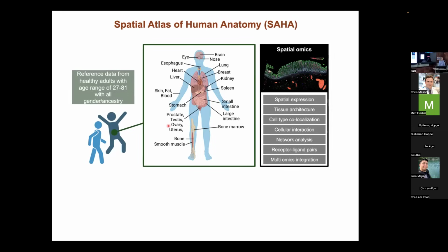So prostate, the whole prostate's been going on there pretty much. But for colon, we just have a few segments from that specific area. The thing is, within a specific zone, the heterogeneity that we've been seeing in a particular anatomic area has been somewhat okay and not creating significant statistical issues. But we've been seeing that also between patients as well. So I think a lot of the heterogeneity we're going to see is as we move through this.